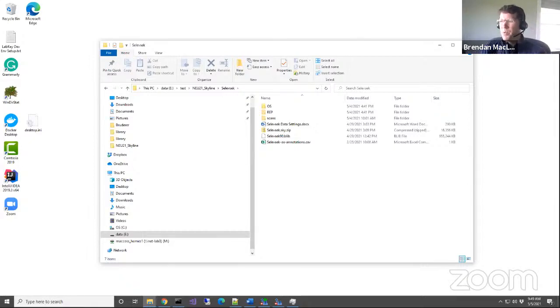Bruker data files are a folder, and they add a calibration file into that folder, and we use DLLs from Bruker to read that folder. So we never go in, even when vendors suggest you could get that information from a file in the folder, because about half the instrument vendors have a folder and half of them have a file format.